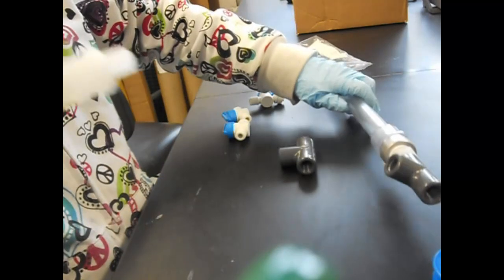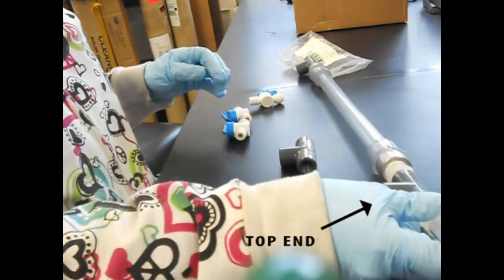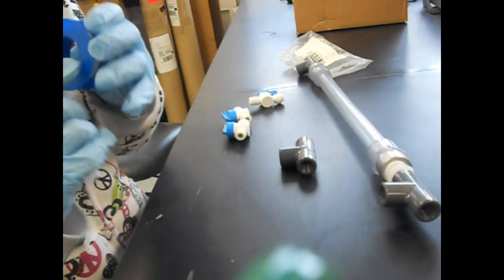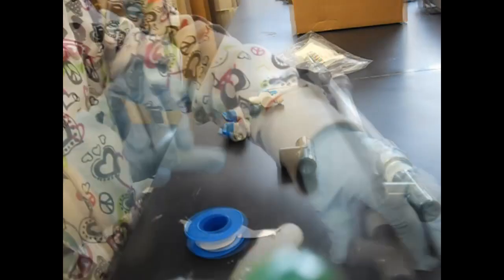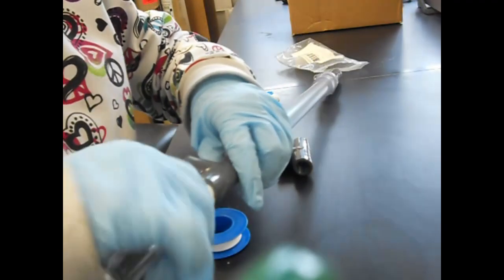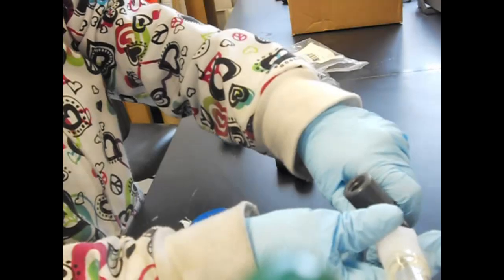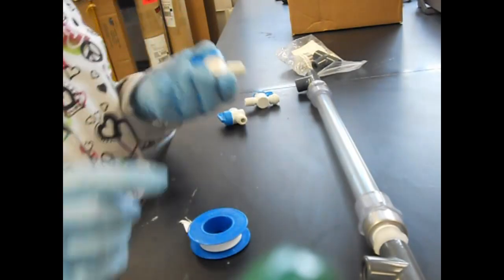For the top end, you need to put this glue tube on the side. Put all these valves on.